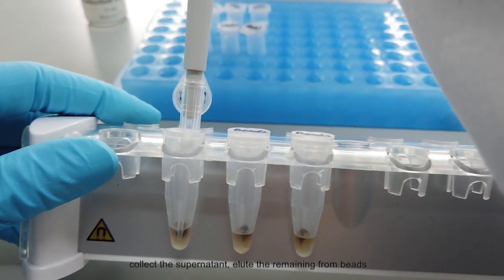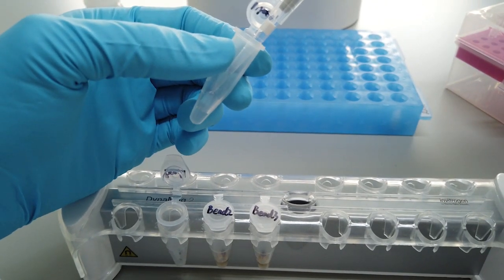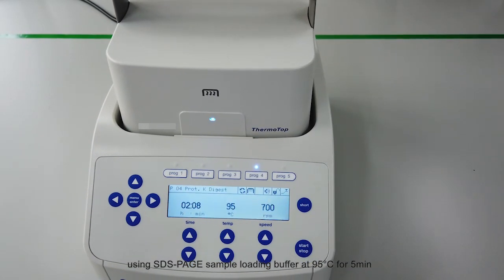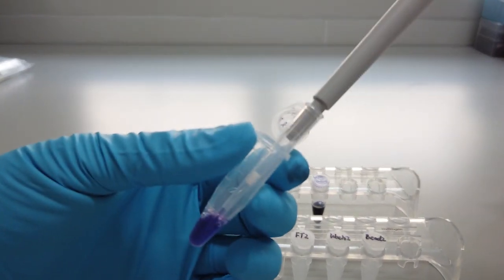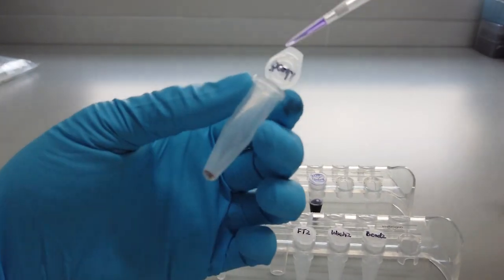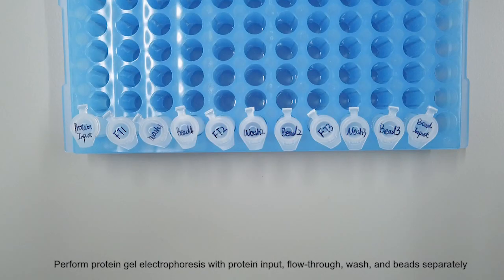Elute the remaining from beads using SDS-PAGE sample loading buffer at 95 degrees Celsius for 5 minutes. Perform protein gel electrophoresis with protein input, flow through, wash, and beads separately.